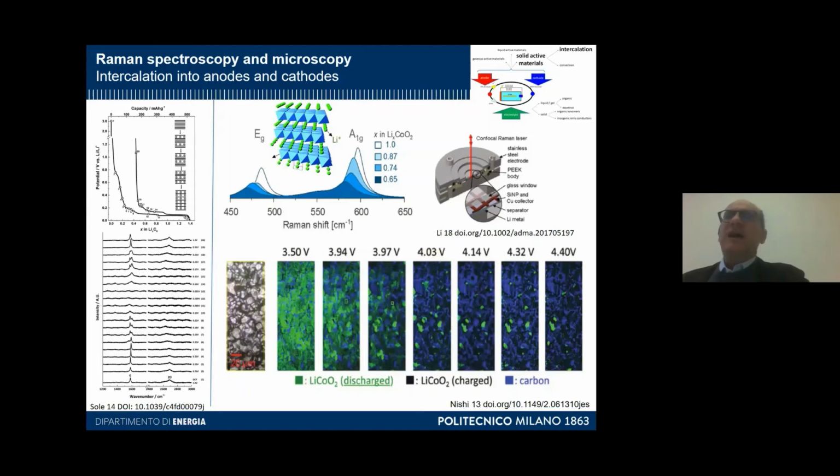Raman spectroscopy allows, in a simple and straightforward way, the implementation of the optics in a way whereby the really active material of the cell can be sampled. So it allows to detect deviations from the nominal structural reversibility of intercalation systems brought about by electrochemical cycling. Moreover, Raman mapping can disclose the space distribution of the intercalation degree in the composite electrode layer, helping prospectively to optimize electrode fabrication and discharge policies.